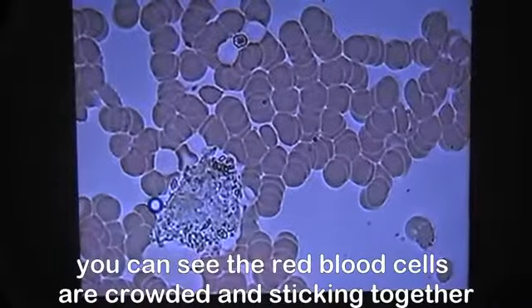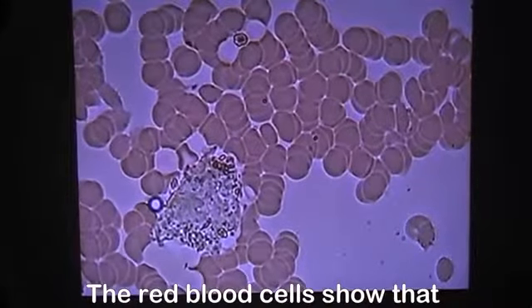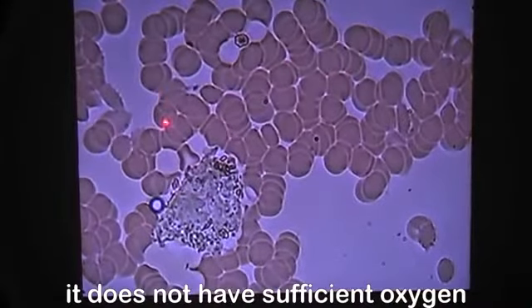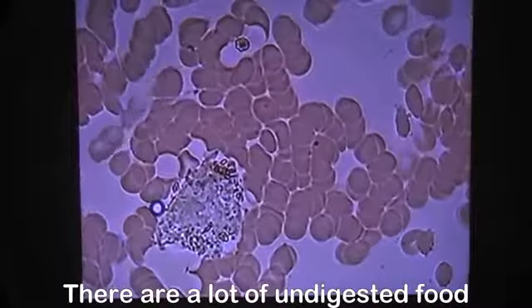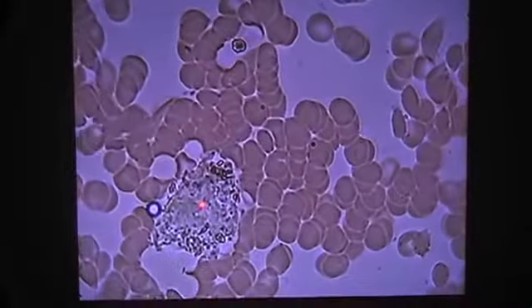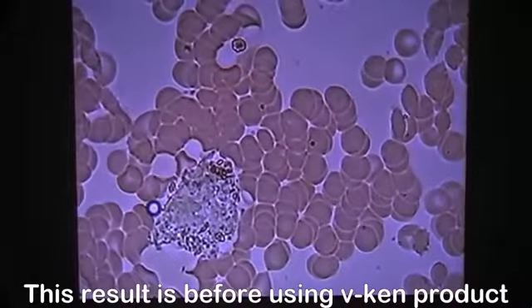As you can see, the red blood cells are crowded and sticking together. The red blood cells show that they do not have sufficient oxygen. There are a lot of undigested food and cholesterol crystals. This result is before using the product.